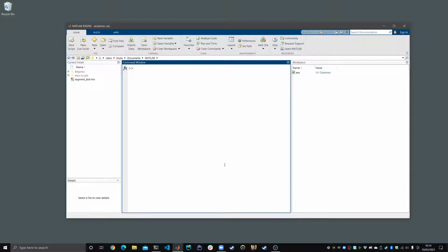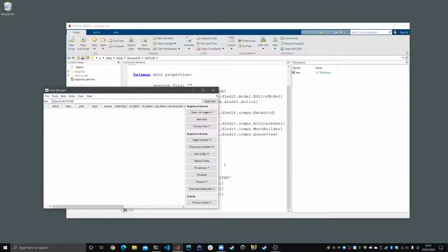In this video, I'll demonstrate how to manage data with a data manager application that comes in the Begonia framework, and also how to perform batch operations in this tool for long-running processing operations. We're going to start by starting the software using dataman.start. And to run this command, you need to perform the steps in the installation video. Here we go.